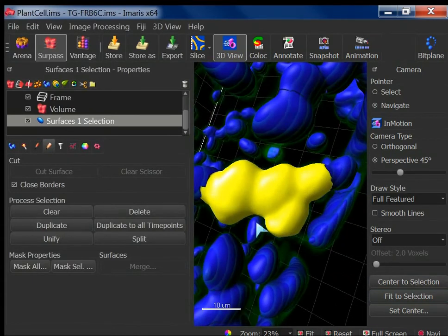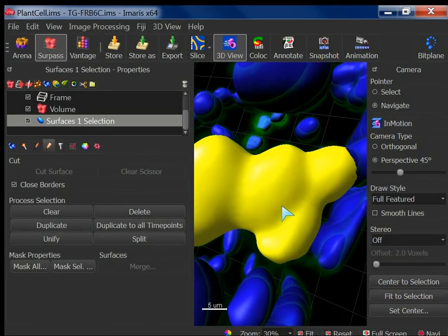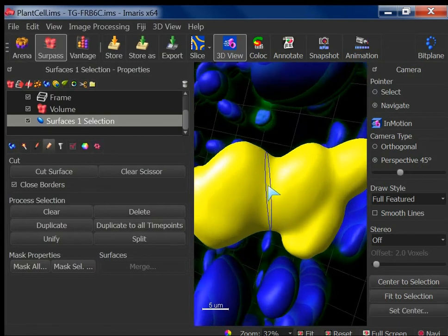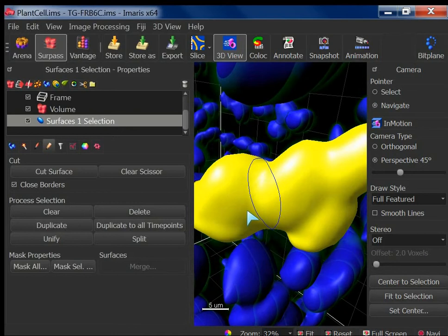Okay, so how do I cut this? Now to cut this, I have to go to the proper plane here, because the cutting will always happen orthogonally, like vertically. Again, I have to change to my select mode, and again the same thing, shift and click. When I say shift and click, this is the blue line. But this blue line is because I said it's orthogonal. For you it looks like a line, but when I rotate this, you can see the plane of cutting. You see.